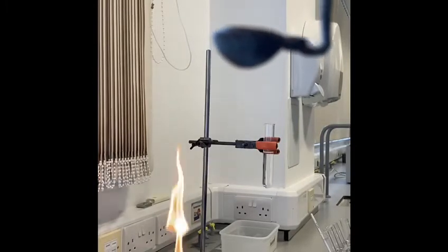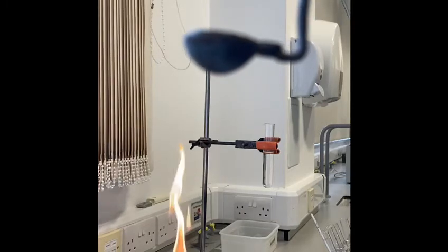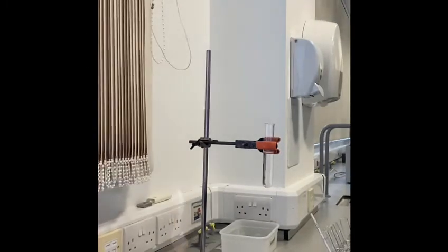After 2 minutes, take a new temperature reading of the water and note it down in your results table. For the investigation, you're going to want to turn the safety flame to the blue flame.